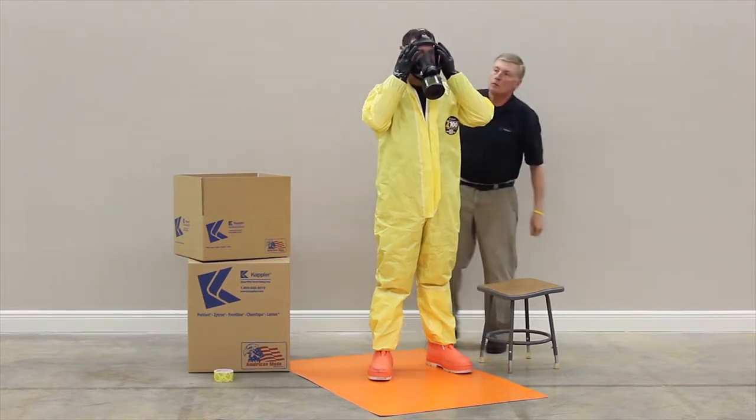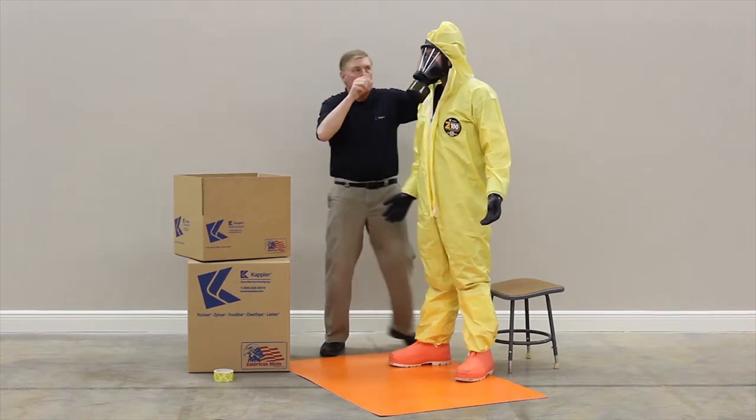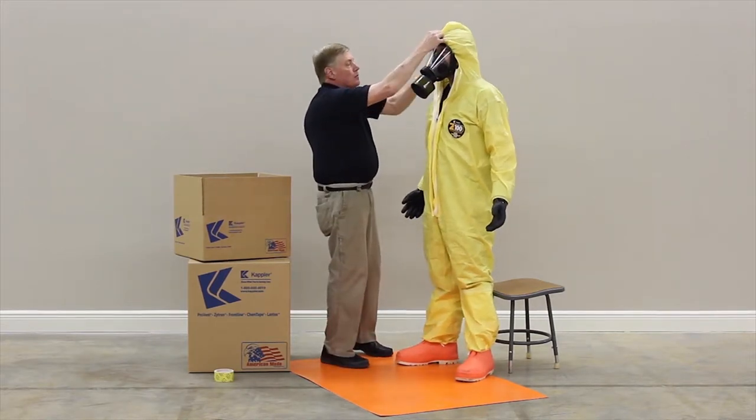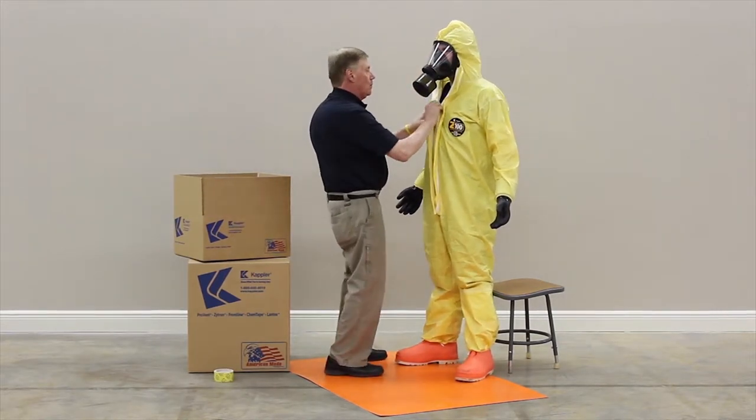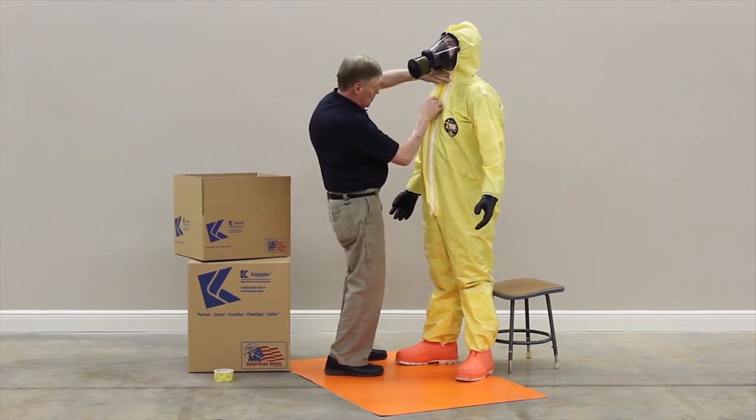Secure the hood around the face piece and inspect for a proper fit and seal with the hood and respirator. Completely close the zipper if it isn't closed already.